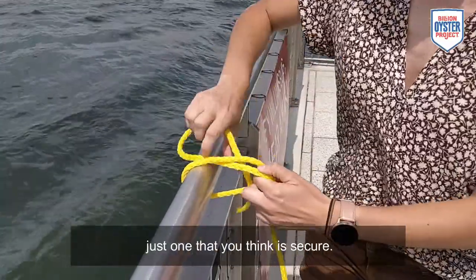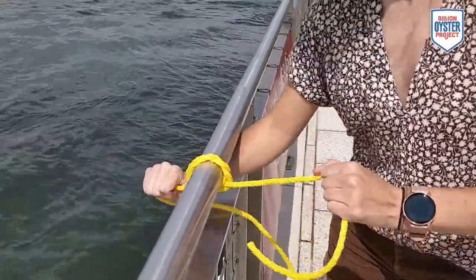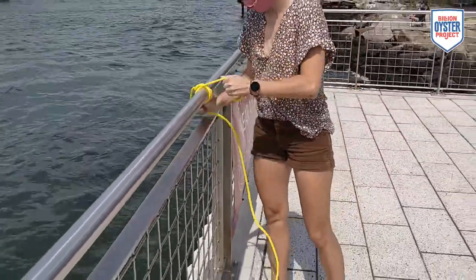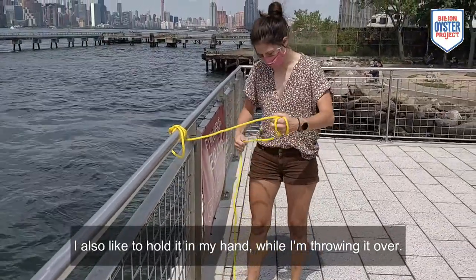You don't have to do a perfect knot, just one that you think is secure. I also like to hold it in my hand while I'm throwing it over.